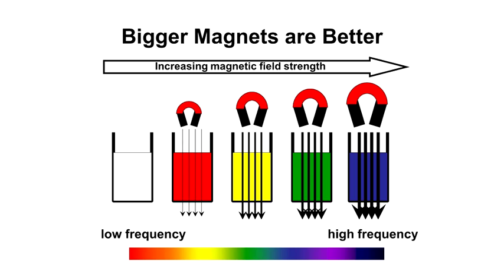So whether it's, again, high frequency, low frequency, high magnetic field strengths, low magnetic field strengths, these are critical to NMR. And we typically talk about magnets in NMR not by the strength in terms of Gauss or Tesla. We typically say this is a 500 megahertz or a 900 megahertz NMR, which is an indication of the strength of the magnetic field and the characteristic frequency of that magnet.